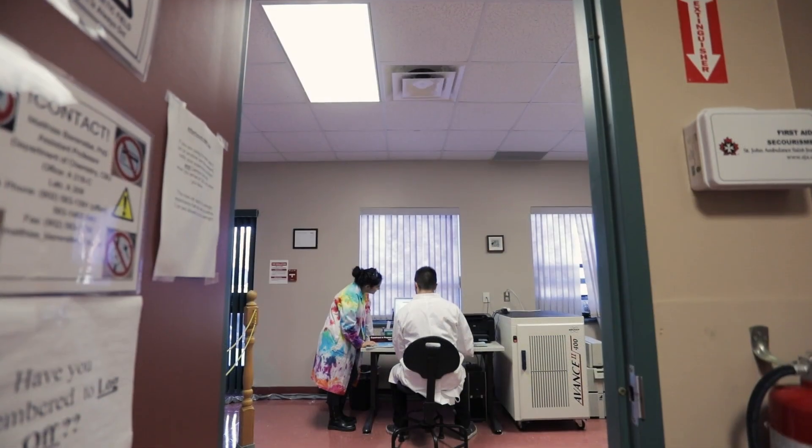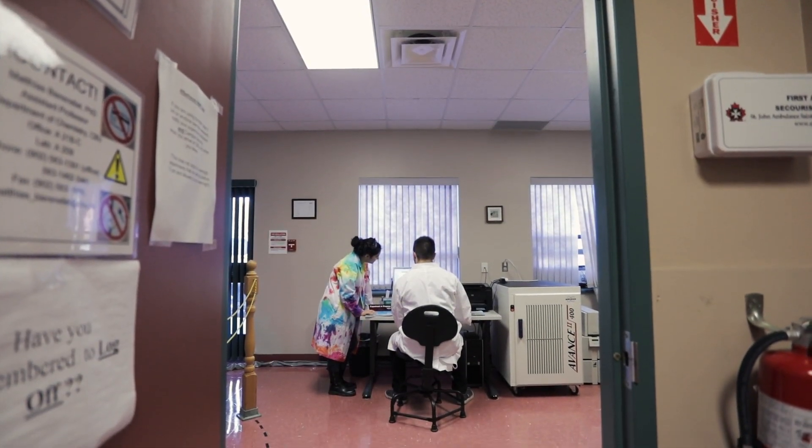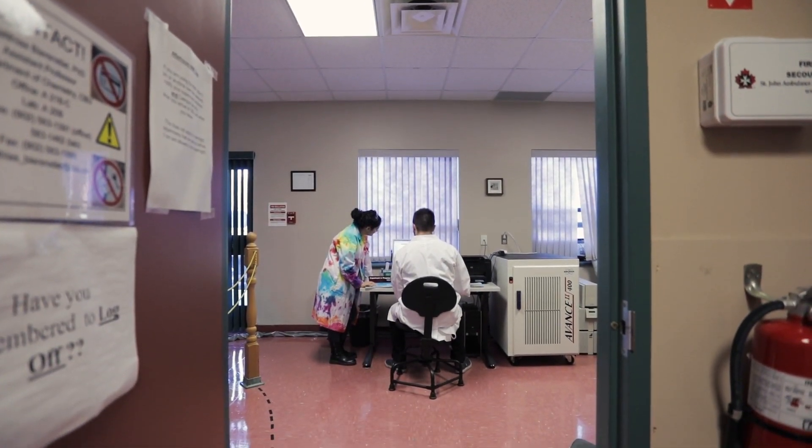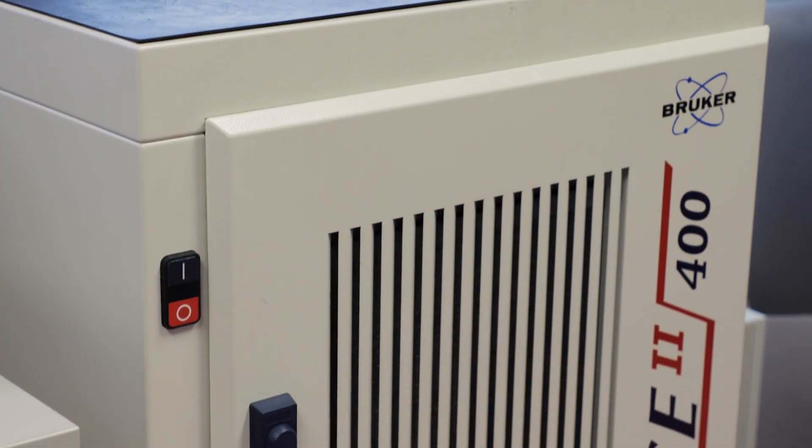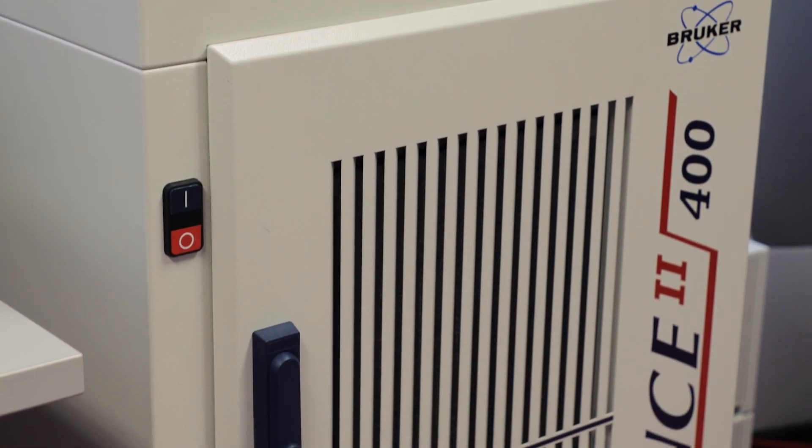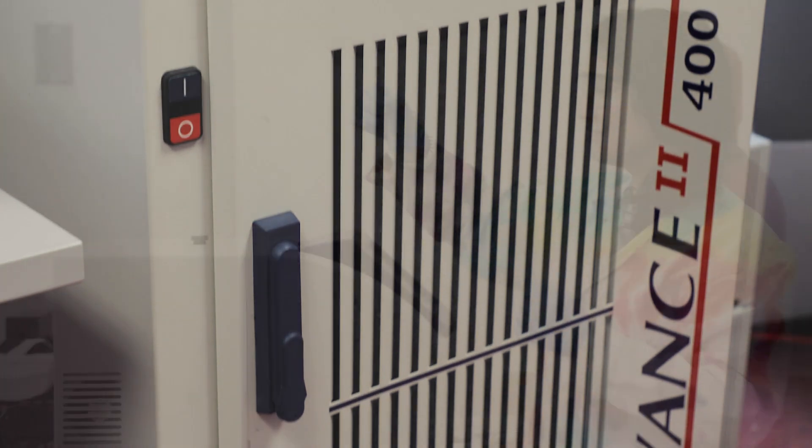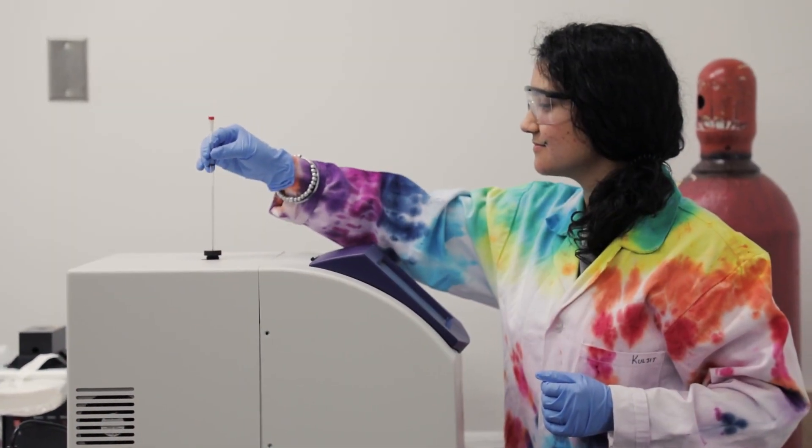In the chemistry department we have a wide variety of instrumentation available to our students. Two of the instruments that we use specifically supplied by Bruker are the 400 MHz NMR Spectrometer and the Electron Paramagnetic Resonance Spectrometer.